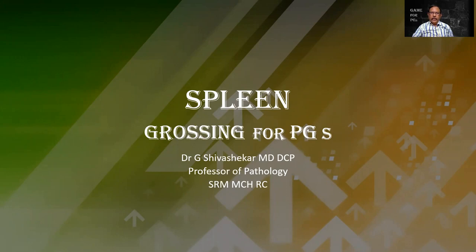We shall continue with the grossing of the organs. And the topic for the day is the spleen. Without much ado, I shall go into the topic proper.